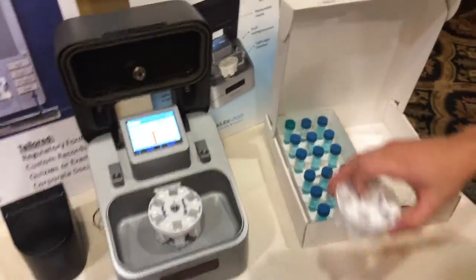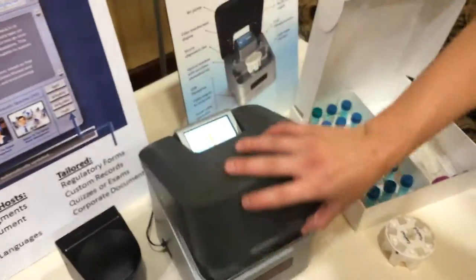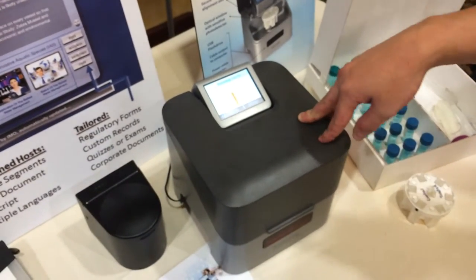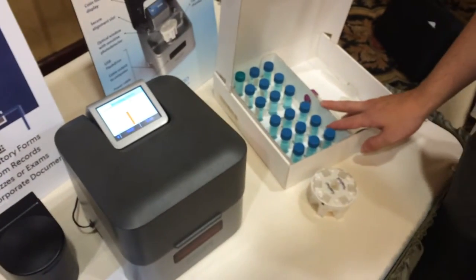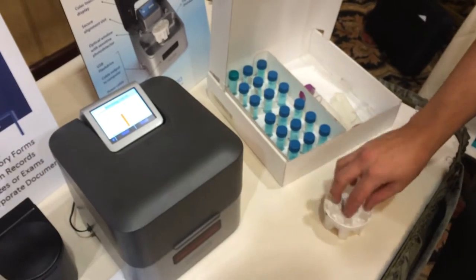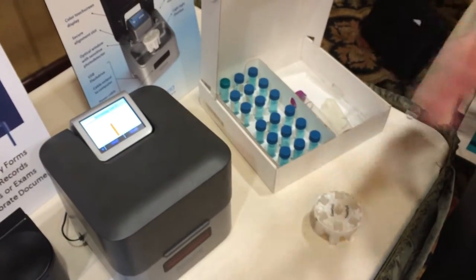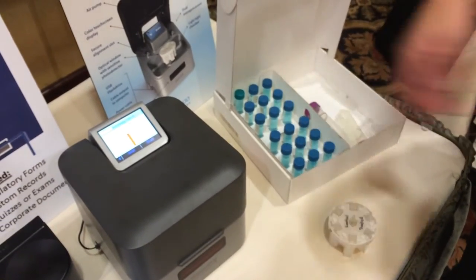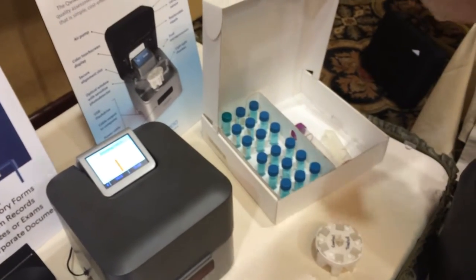How much do these cost? This unit is $5,000. Then there are $50 test kits — the test kit includes six cartridges, basically one control and five tests with the plankton supplied. So those are $50 test kits to get resupplied, which works out to basically $10 a test.